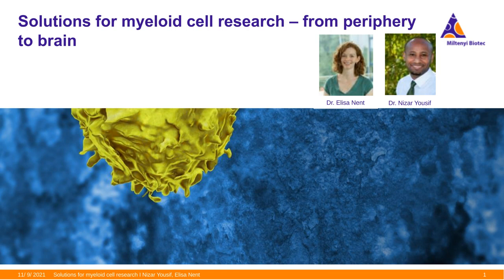Are there differences in the downstream applications of the different monocyte isolation kits or microbeads, for example, for the differentiation of monocytes into macrophages? No, not at all. Using either positive isolation of monocytes with, for example, CD14 MicroBeads or untouched isolation with monocyte isolation kits, you will be able to differentiate the isolated monocytes in culture into macrophages, of course with the help of specific cytokines and stimulation factors. It's just a matter of preference.